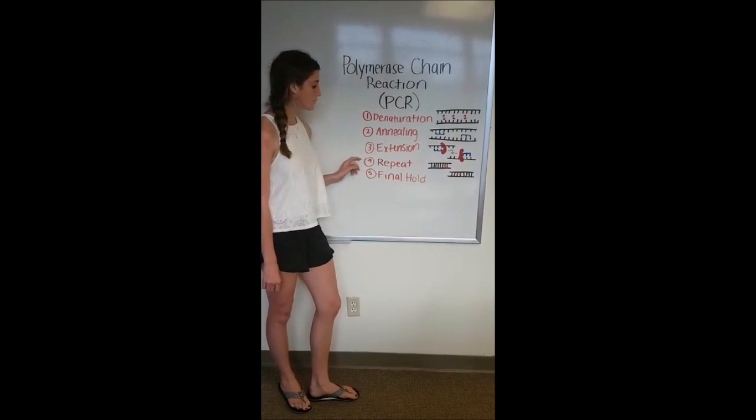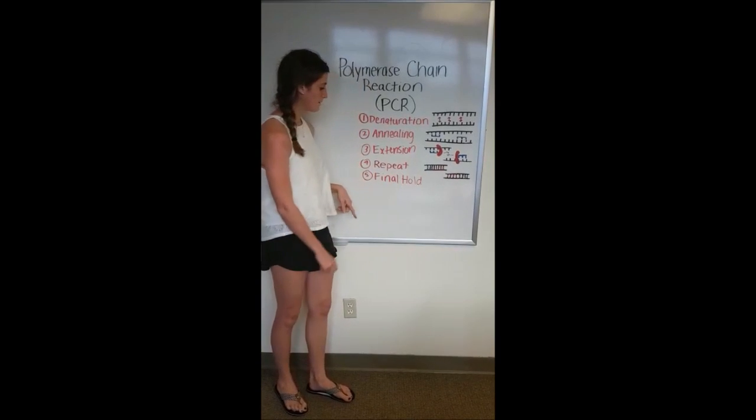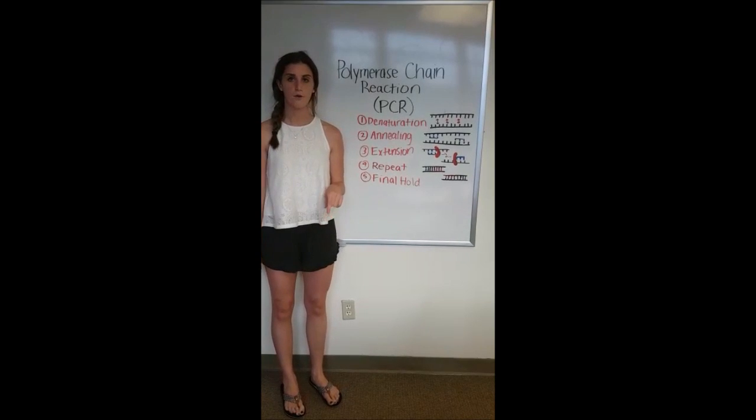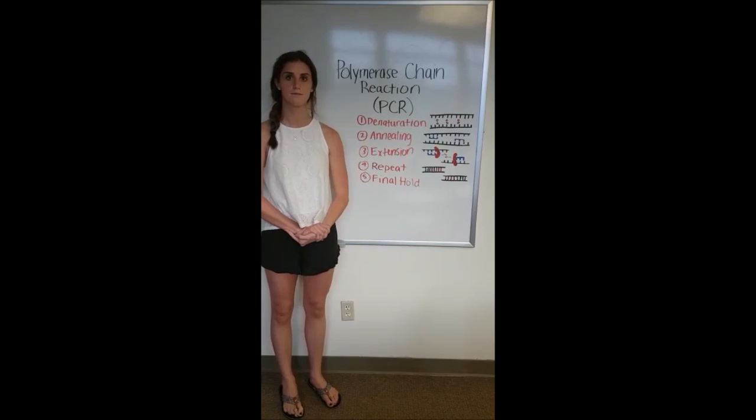This whole process is then repeated many times to create many strands of your segment of DNA, and then there is a final hold at 4 to 10 degrees Celsius to renature the DNA and finalize the process.